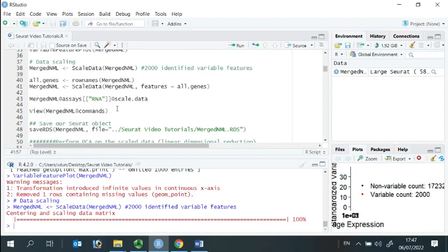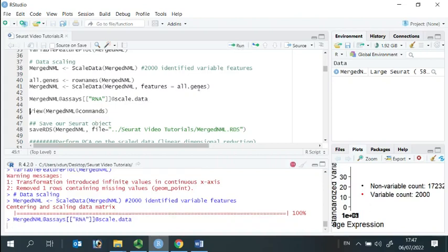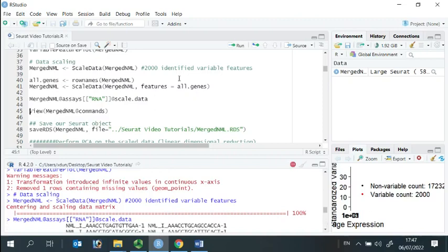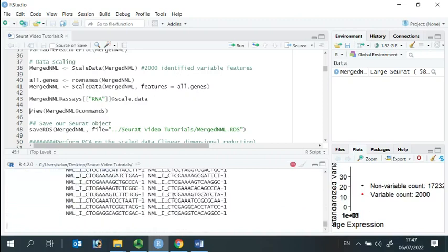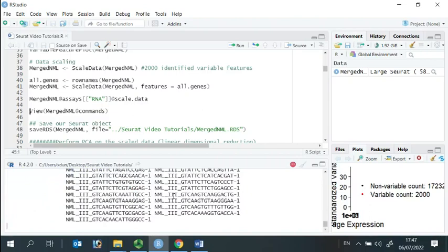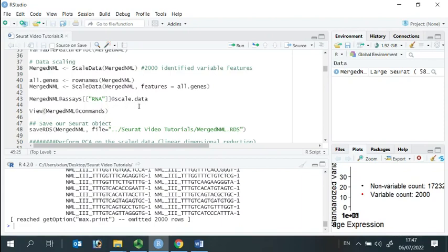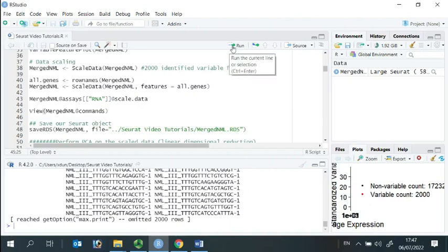Let's have a look at the scaled data. You can see, the scaled data has been stored in our Seurat object.